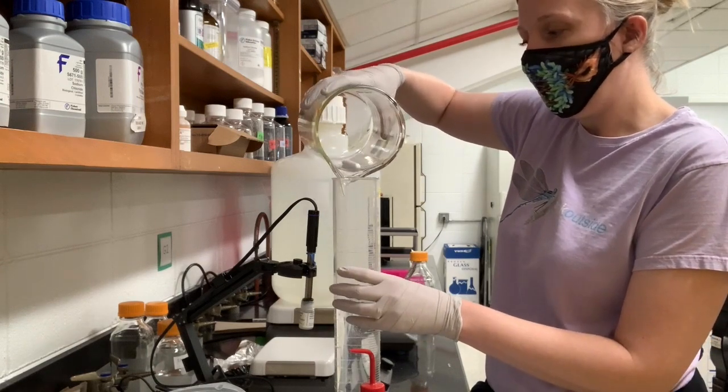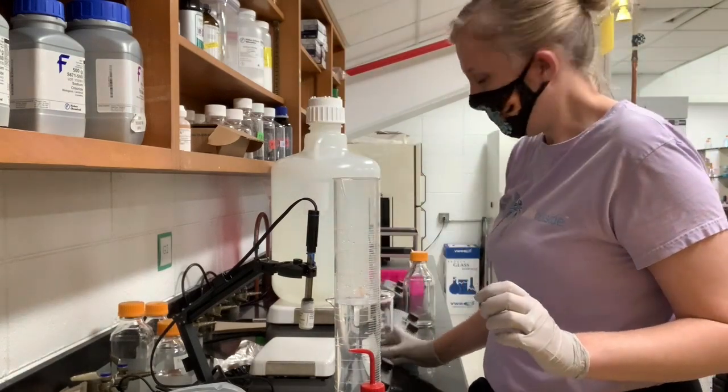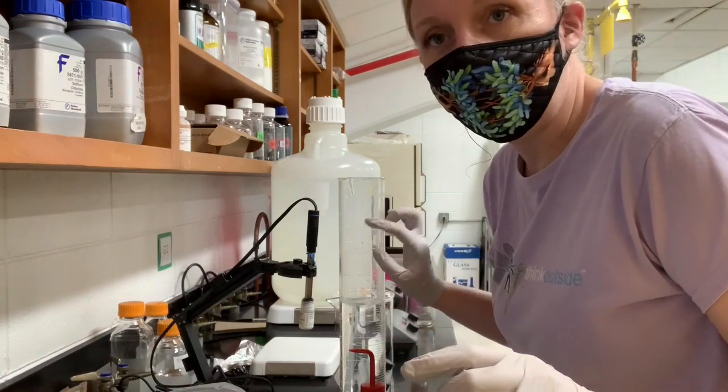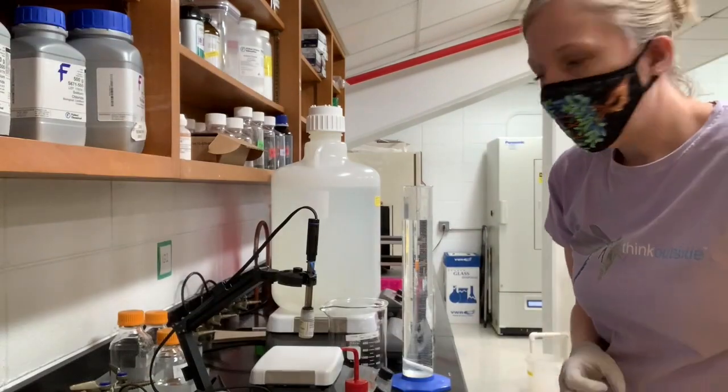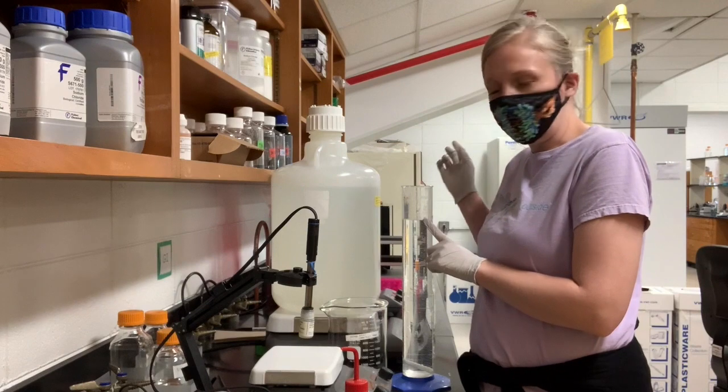And it's okay if the magnet goes with it. So I'm going to go take this into the other room and fill it up to 1 liter with water. So now I've added ultra pure water from the blue and white machine.